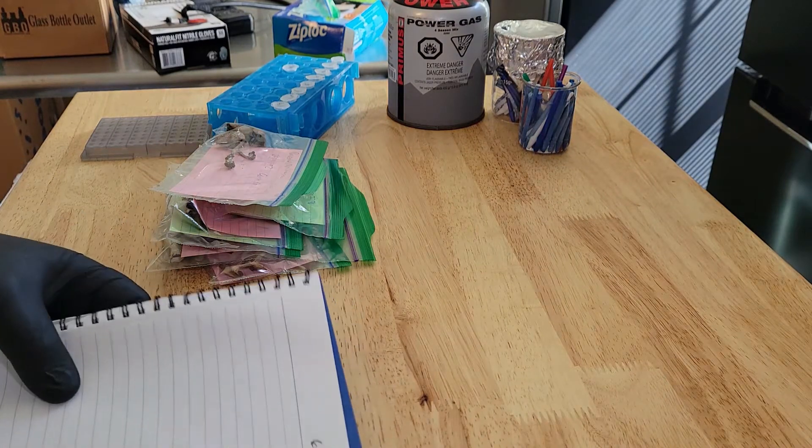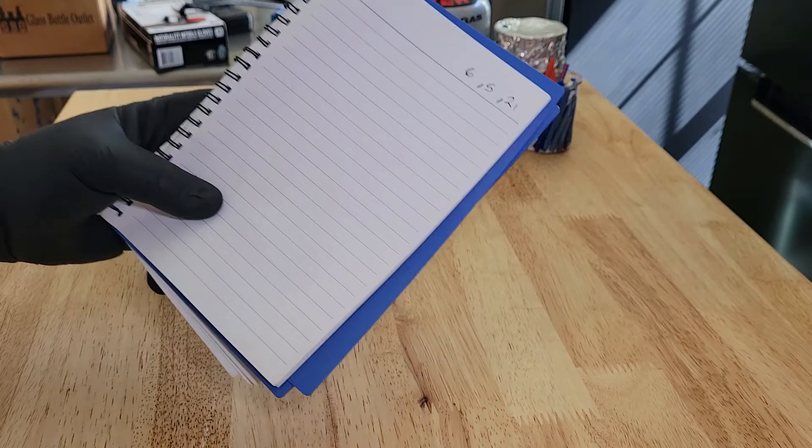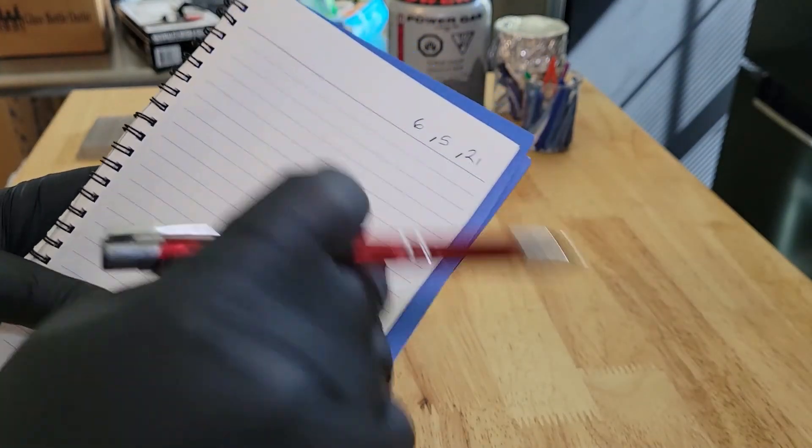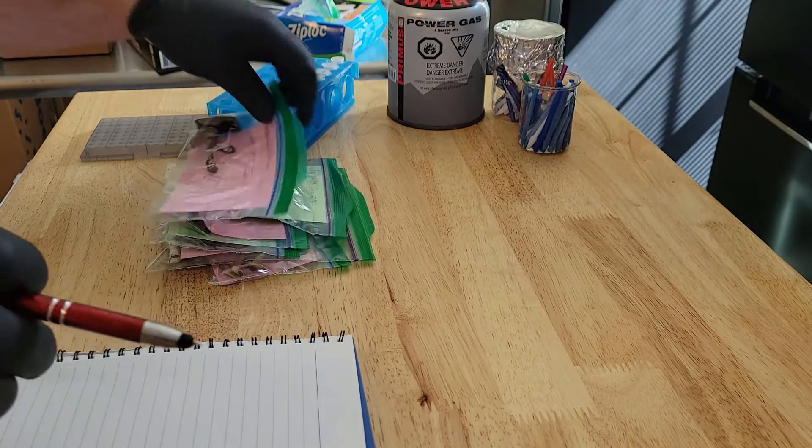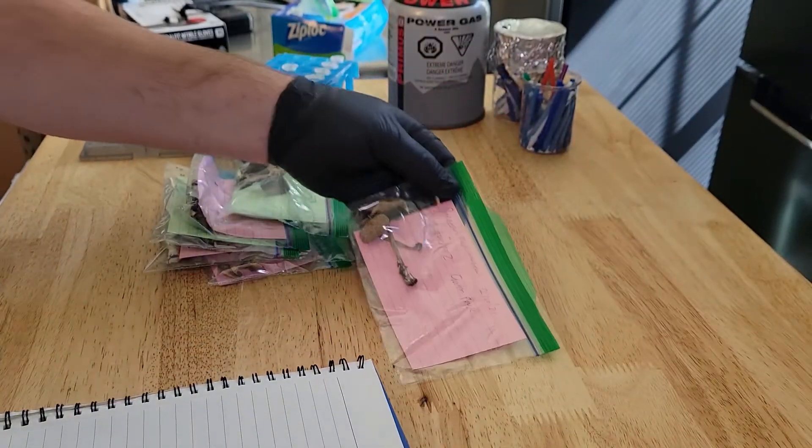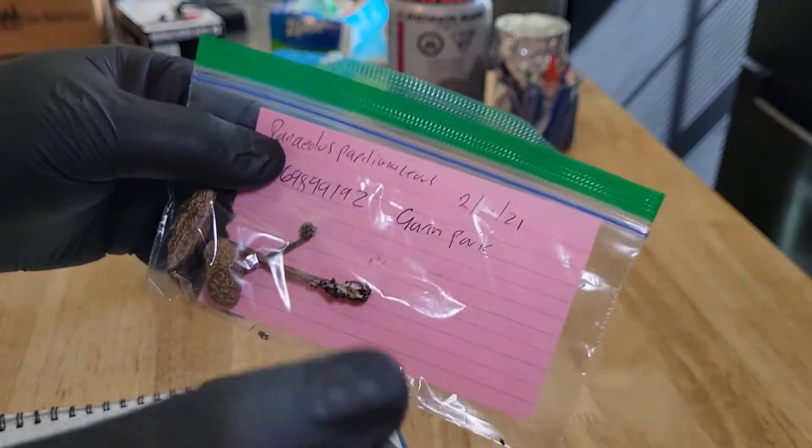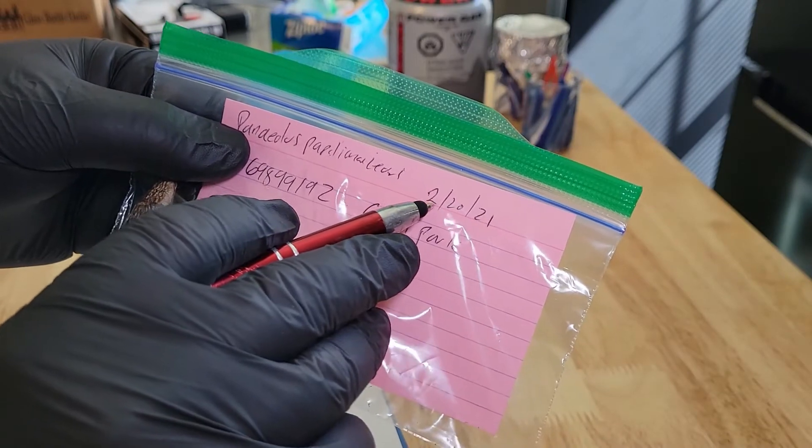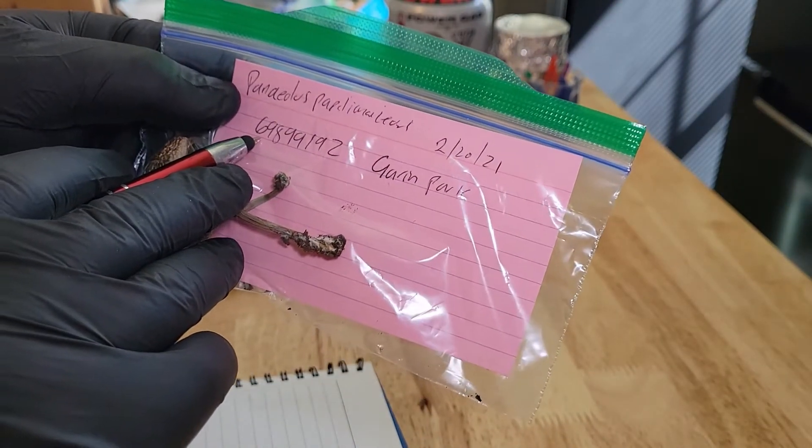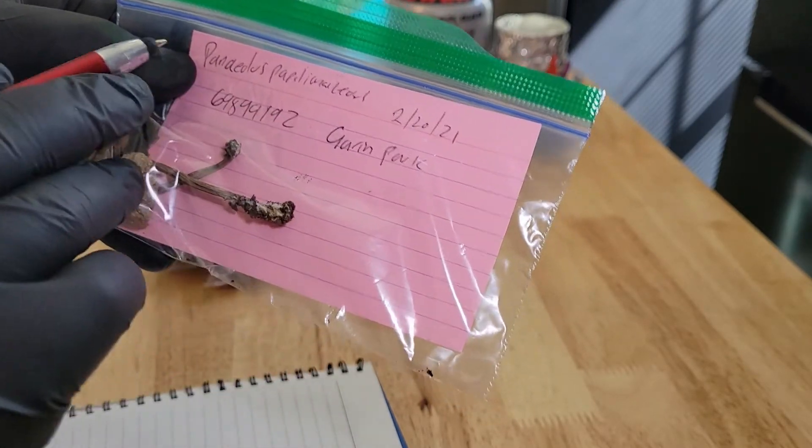Just like in class, in our home lab, we're going to keep a lab notebook. I'm going to start by putting the date, then go through my samples and assign them a tube number. The first one is Panaeolus papilionaceus that I collected February 20th. Here's the iNaturalist observation number.